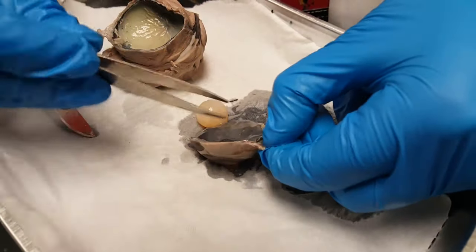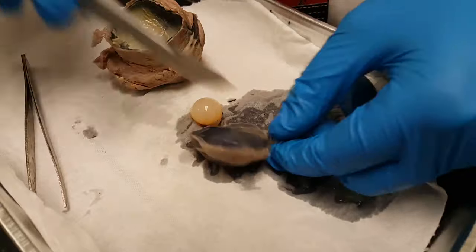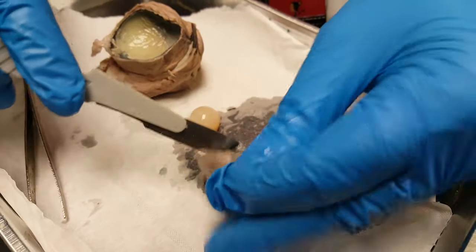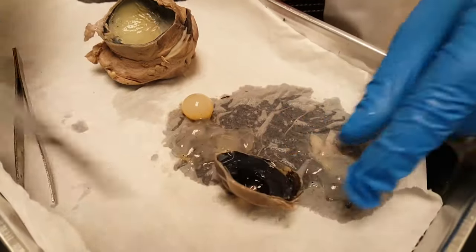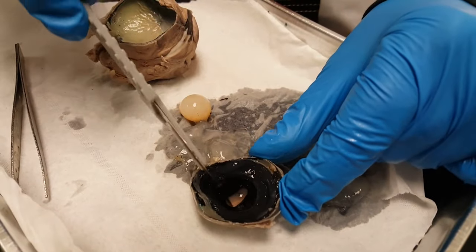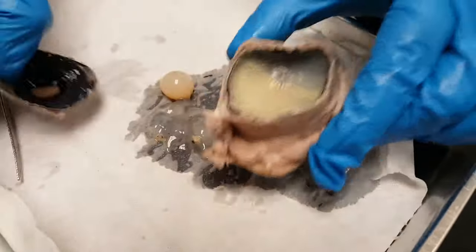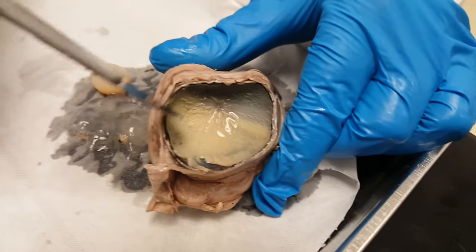Behind the lens, this dark stuff is the iris. Just removing all the vitreous fluid — and now you can see the iris, and the hole in the middle is the pupil.